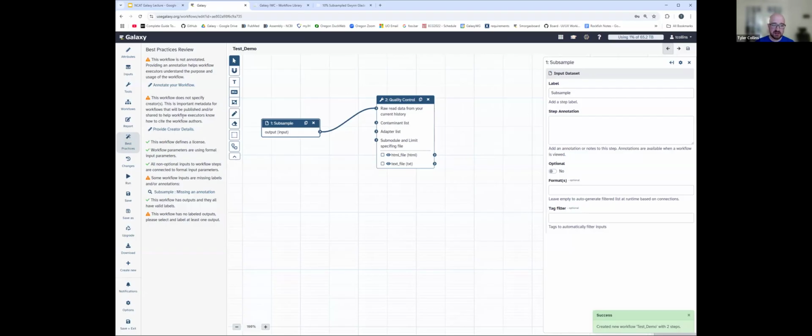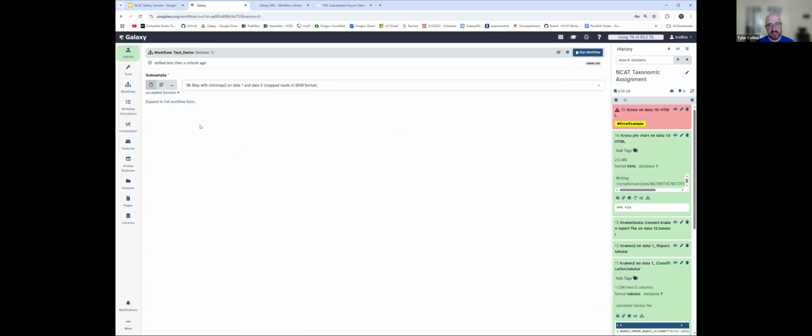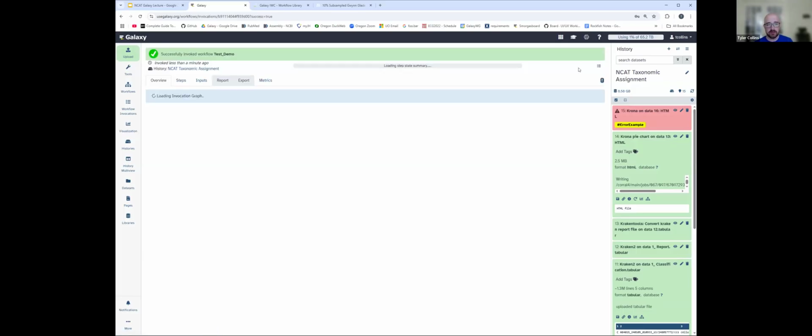Once our workflow is saved, we can do something as simple as come here and click run workflow. This will take us out of that editor and into this menu here. This is the simplified form and how we'd recommend looking at this. Essentially, all this needs is that input we put in called subsample. So we just need to pass in one FastQ subsampled file. We can pass in our subsample DNA here that we pulled in. We can just hit run workflow.